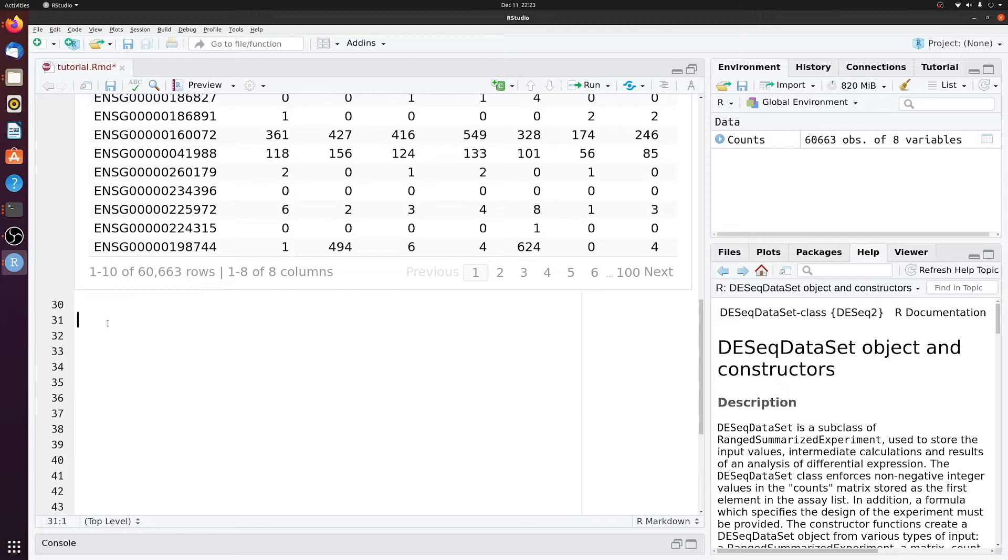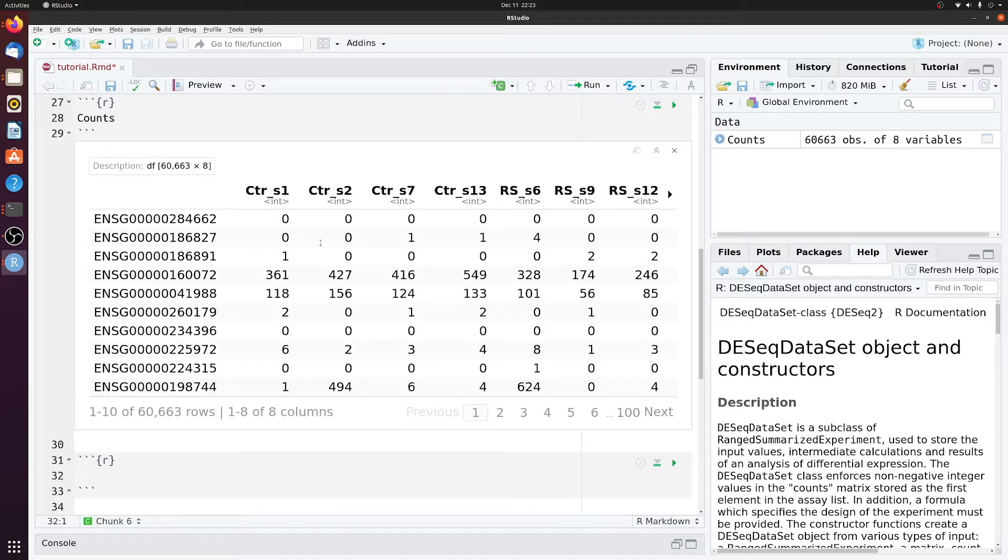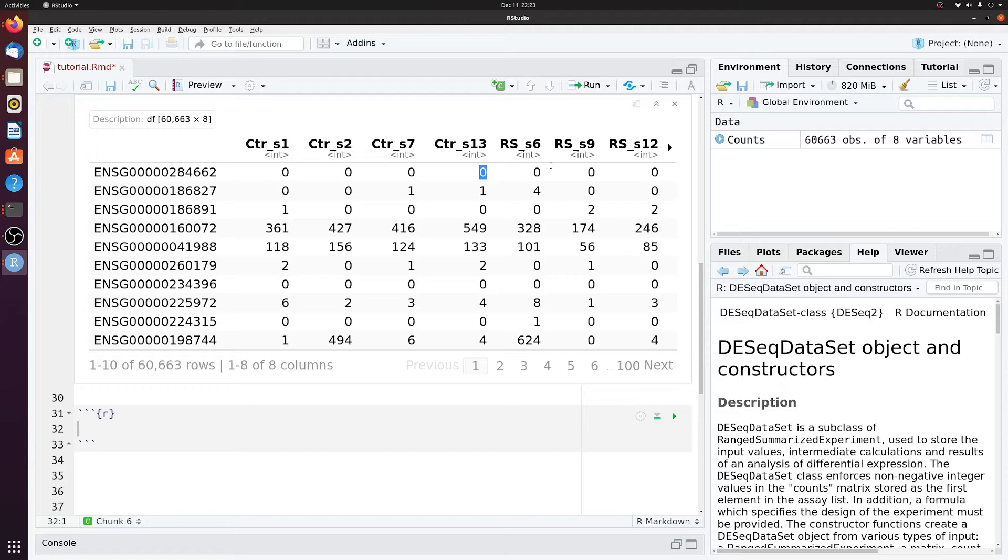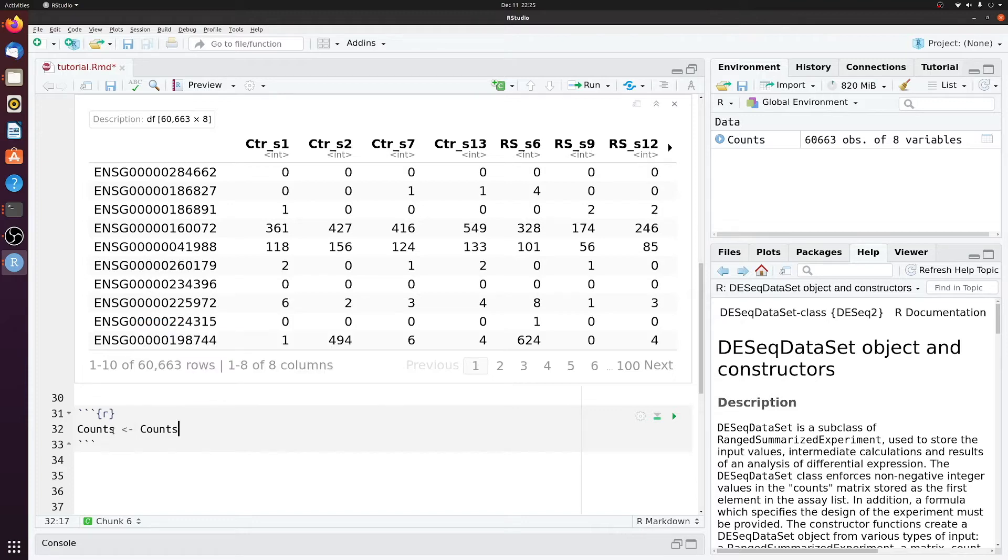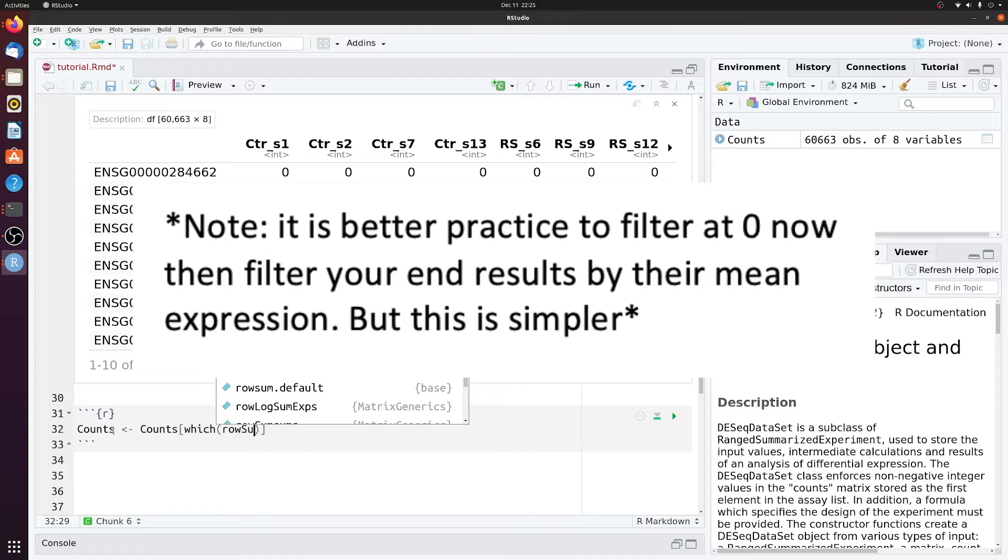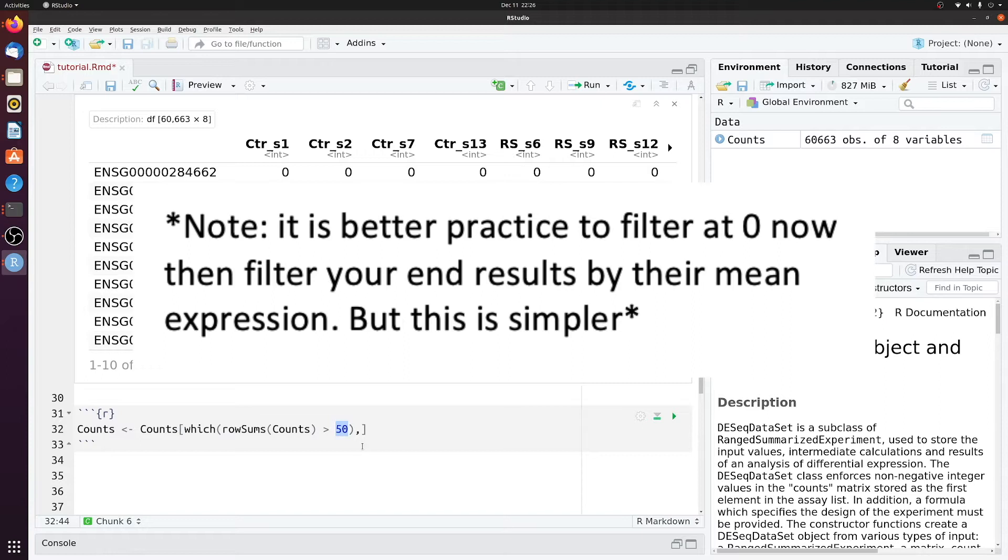So what we're going to do first as a very simple pre-processing step is we're going to filter out everything that has a sum of less than 50. 50 is kind of arbitrary, but obviously you're not going to do differential expression between zeros and zeros. And then really low numbers can add a lot of noise. To do that, we'll just reassign counts as a filtered version of itself.